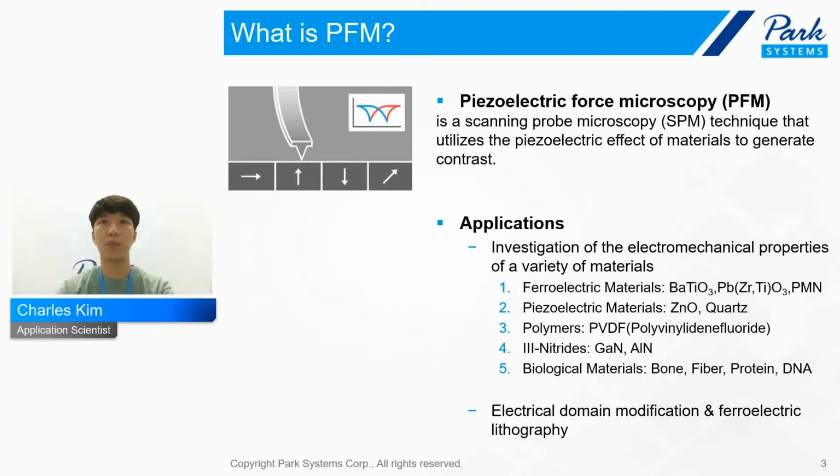In this case, the most popular sample candidate for PFM is the ferroelectric material. And the second one is piezoelectric material. And for special cases, you can use polymers and nitride compounds, and also biological material sometimes can get the PFM signal.